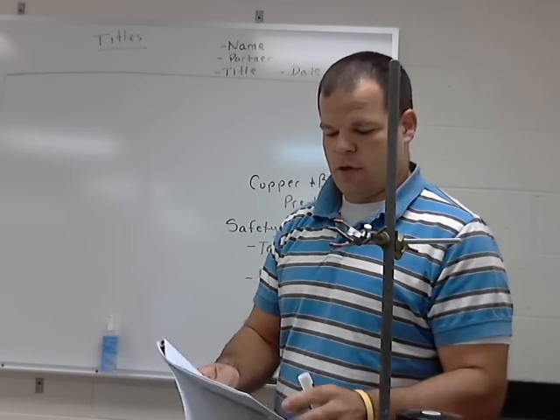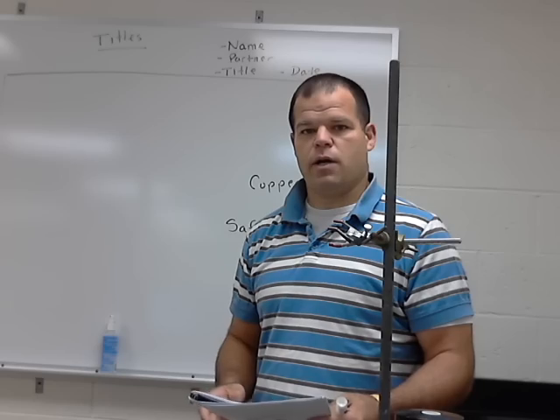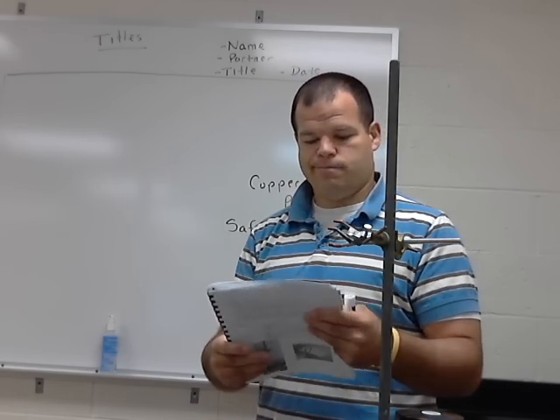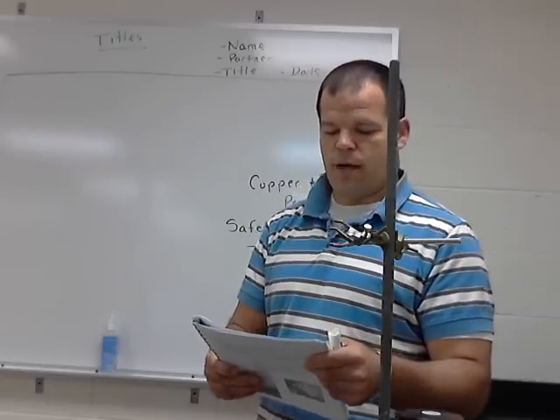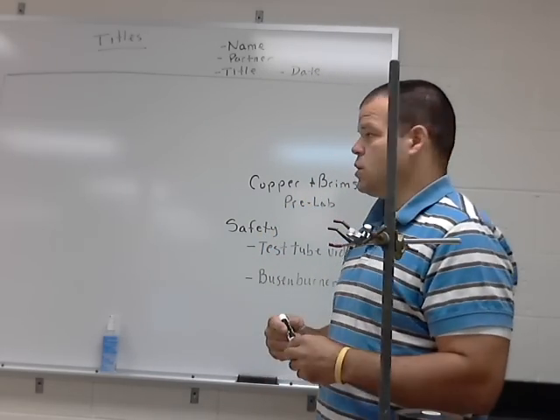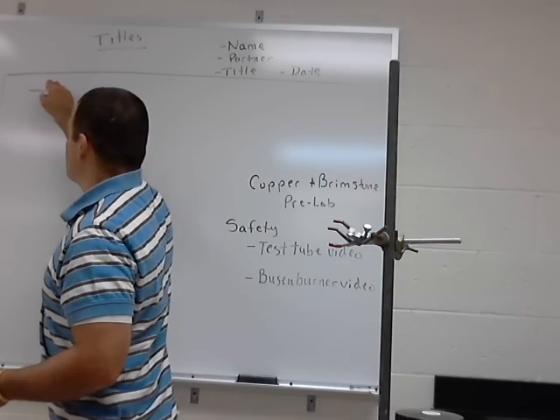It says, the very first part one, obtain your materials. Okay, and I'm just paraphrasing what the procedure says, and you can read that. Number two says weigh out a sample of 4.5 grams and 1.0 grams of copper and sulfur respectively. So that's the first thing you're physically going to do. So what I would do is I would, in my procedure section, draw out a picture.